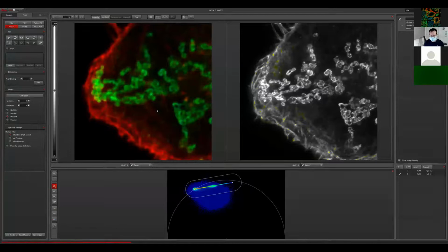Of course it takes some time, because I want to acquire as many photons as possible. With this sample, the dyes were really, really good. And of course, with FLIM and with any microscopy technique, the more photons, the better.